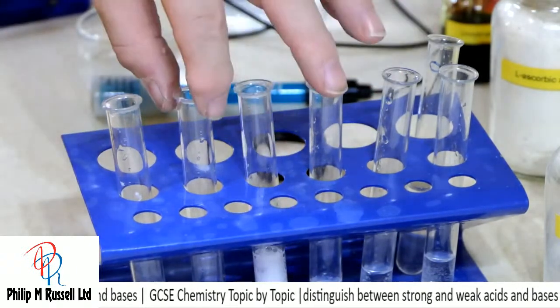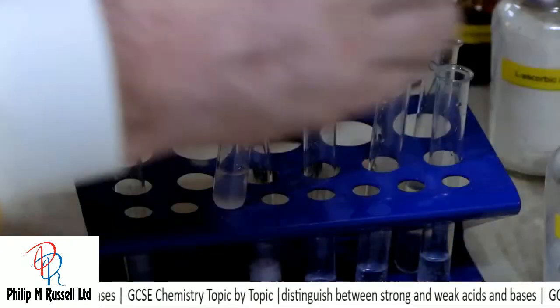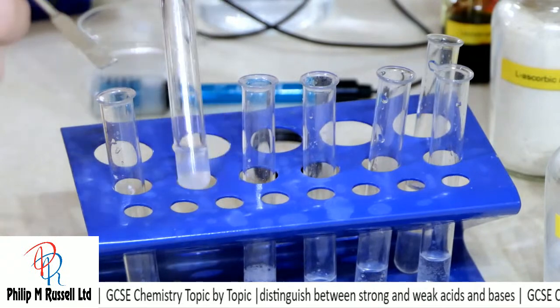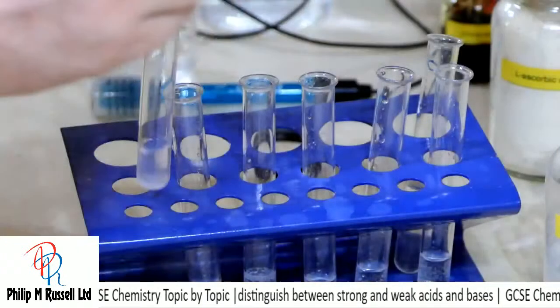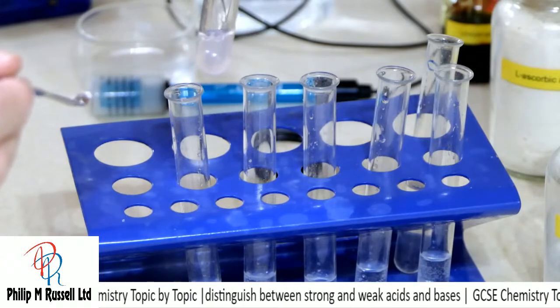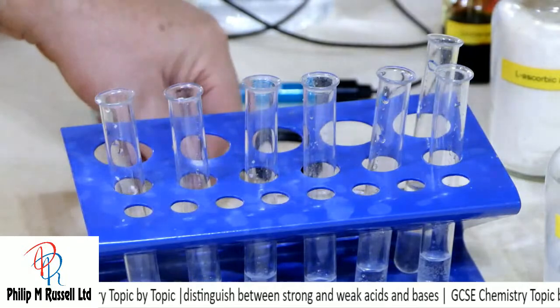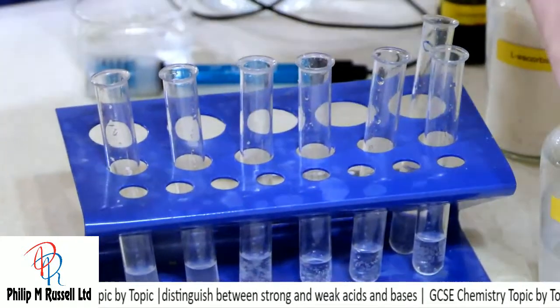So we are seeing now a difference. The 0.1 molar not really doing an awful lot, and the 0.1 molar diluted 10 times, then not much action. So as we dilute the acid, it is becoming less reactive.